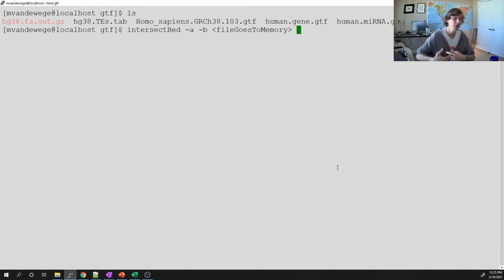And so whenever you're actually interacting with any kind of file, say you're opening up a Word doc, what you're basically doing is moving that file, or creating a copy, from your hard drive and putting it in your memory. And so now you're using that memory stick that's like 4 or 8 gigabytes, give or take, whatever's on your computer, to look at that thing. And so memory is much more limited than hard drive space.